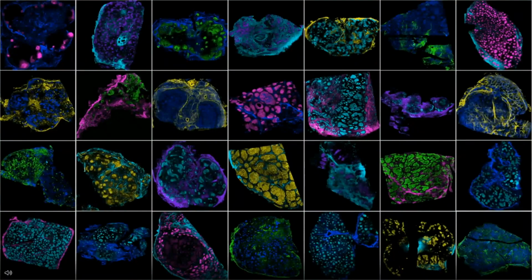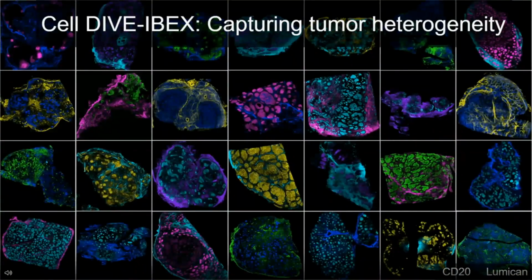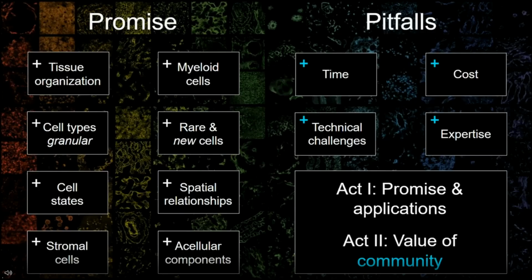And then in the hopes of creating better therapeutics or targets for the patients, especially those most vulnerable. So now we could do that again with the Cell DIVE IBEX integration. So now we're transitioning to part 2 of the talk, to talk about how, while these are very promising technologies, there's still a lot of barriers.